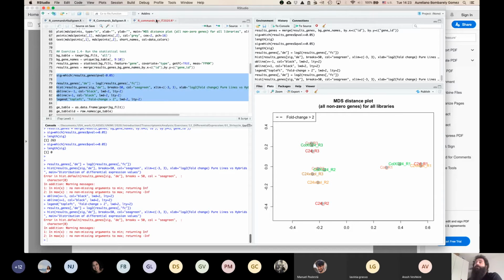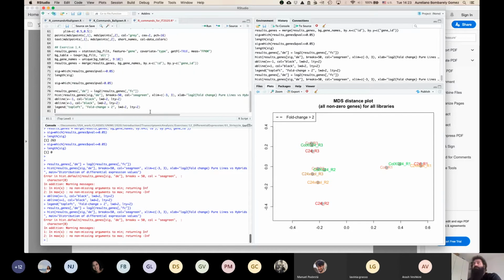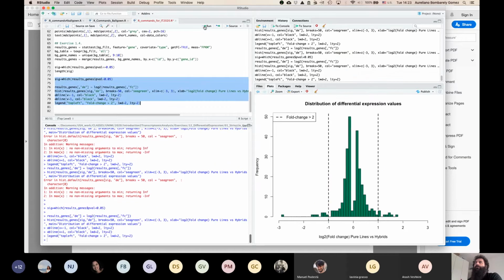Let me copy and paste. Maybe that will work. Okay. Yeah, as I said, somewhere there we have a problem with a quote or something.